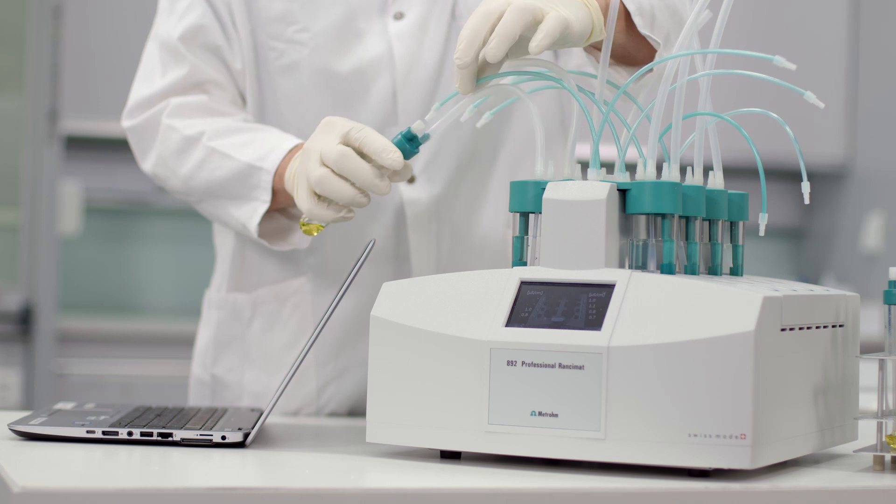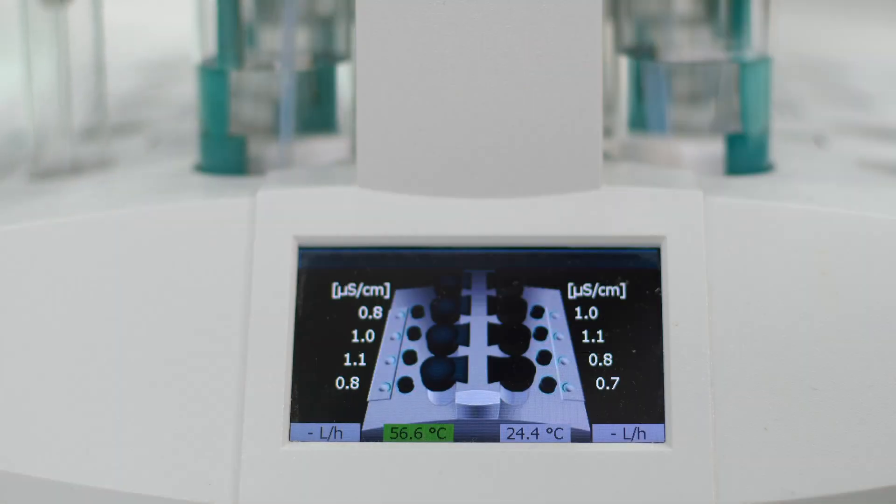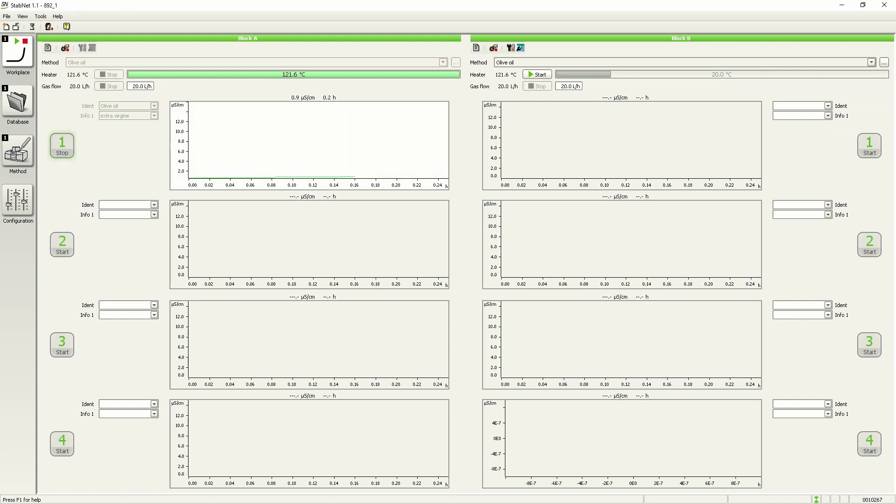Insert the reaction vessel into the heating block and start the measurement. The measurement is performed automatically by the system. The system detects the end point and stops the measurement.